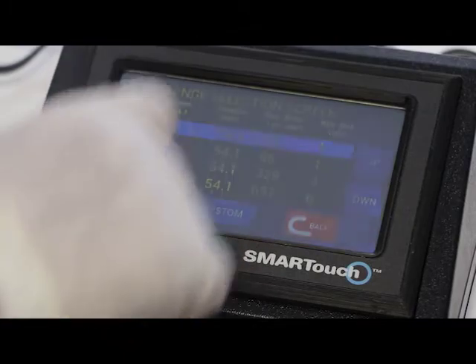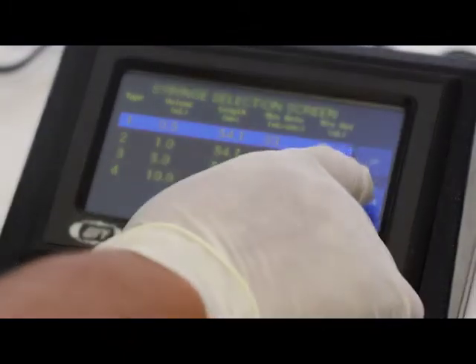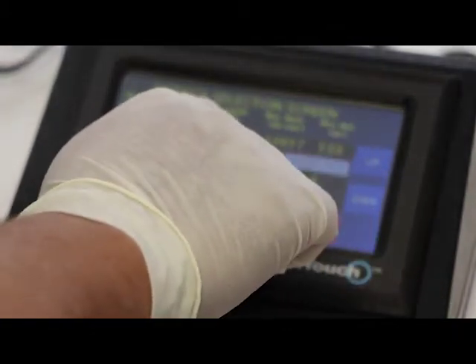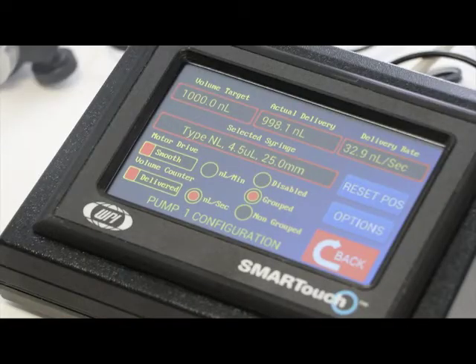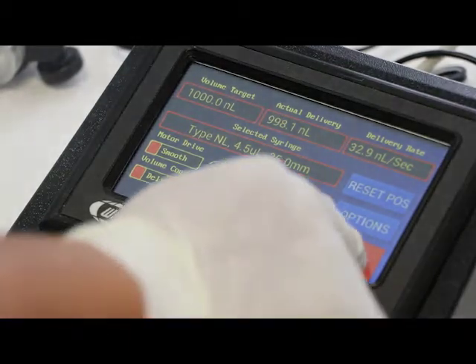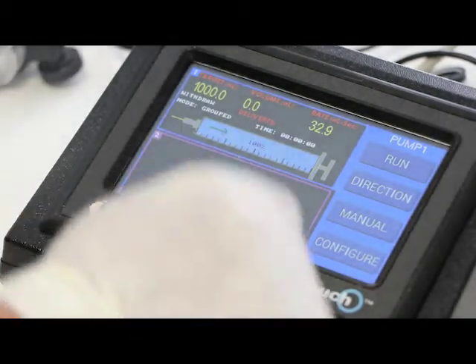You're going to hit the select syringe and you're going to bring down until you get to the correct one which is NL. And you highlight it. When you highlight it you hit back. And you have now selected the correct syringe or the correct type of injector to use with the nano-liter injector.